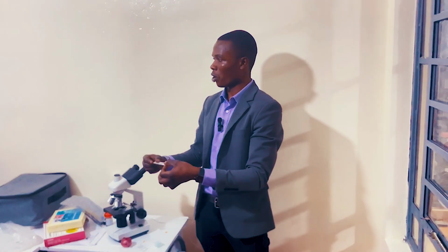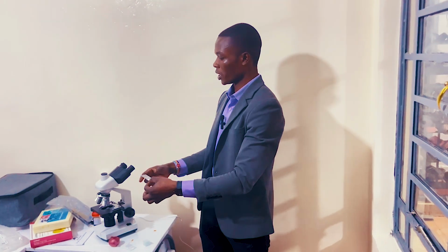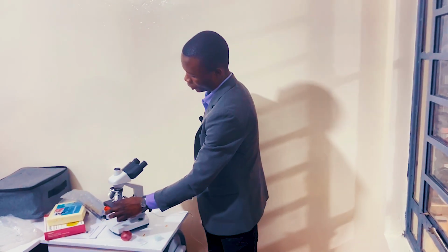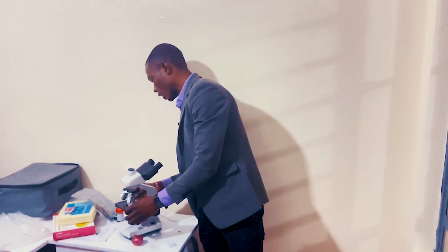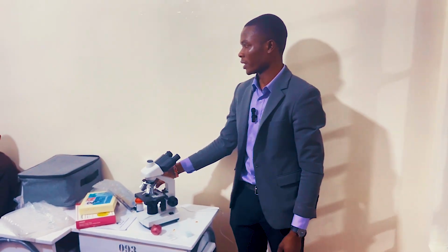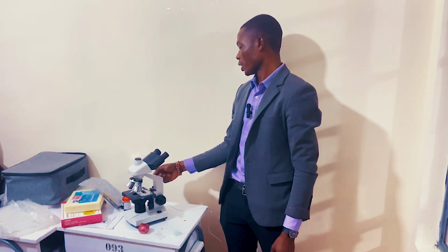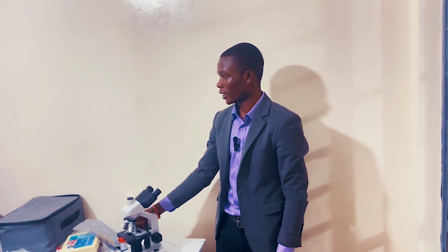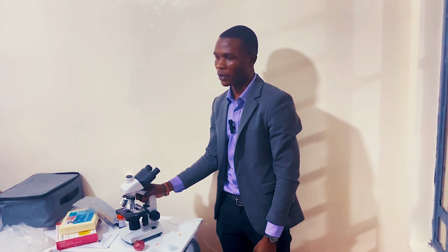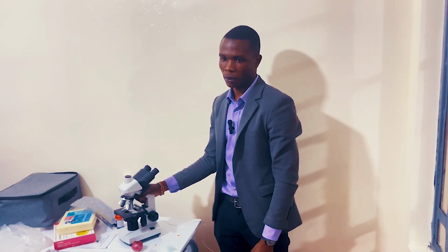So after you have done all those three processes, now you bring it to the stage. In the stage we also have a clip, which is used to hold the slide in place. So the slide cannot move because it is held by this clip. Are we together at that point? If you do all that I've said, we have prepared a specimen to be viewed under a microscope. Are we together?